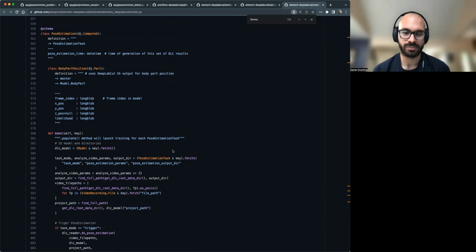Yeah, it's currently the case that these long blobs will give you the pixel value by frame index. So you could take those and write them as a CSV, or you could have some helper function later collapse across all of the subdirectory CSVs or H5s, whichever you actually want to manage, when you generate the NWB.